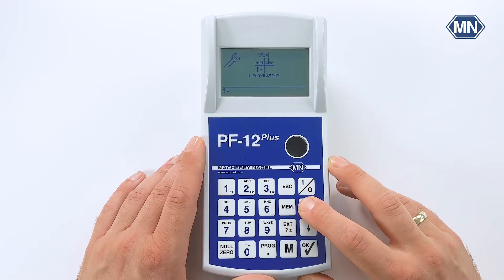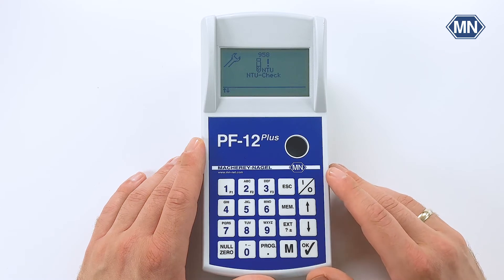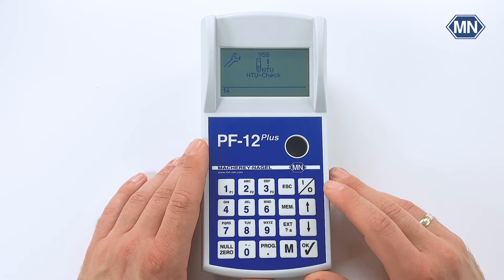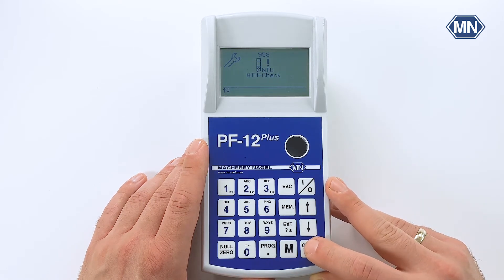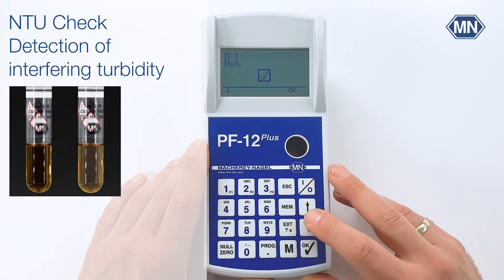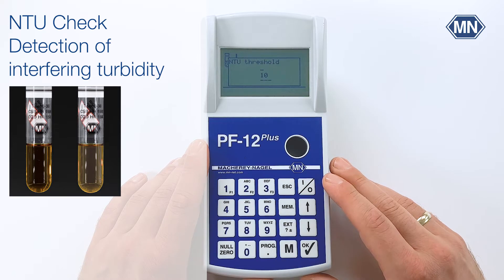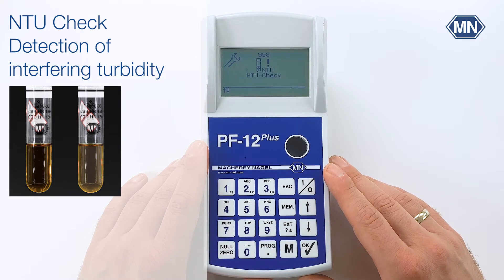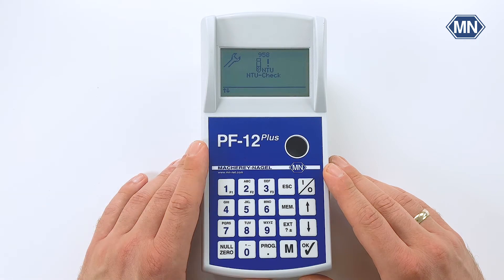Finally but yet importantly, we want to enable the NTU check. This feature allows for the well-established NTU check of the Macherey-Nagel photometers, now also available on a compact photometer such as the PF12+. To enable the NTU check, navigate to the box with the check mark and enter the NTU threshold. From now on the photometer will warn the user when the pre-programmed NTU limit is reached within a measured sample.